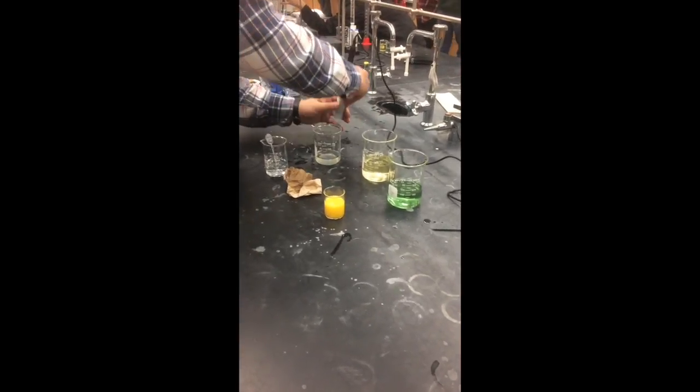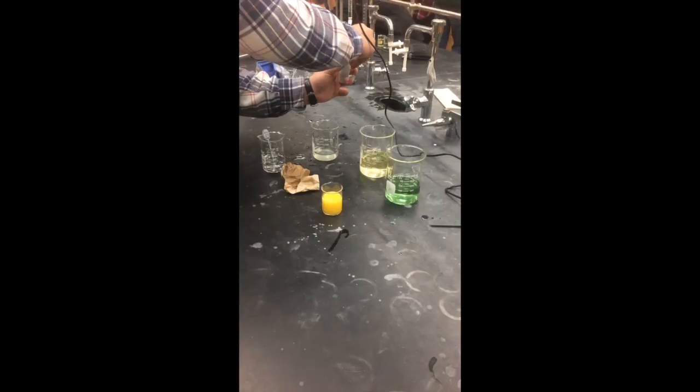When storing, put back in the storing solution and close the cap tightly. Place upright on the table. And that's it.